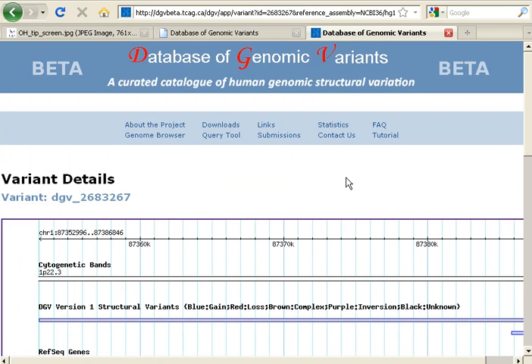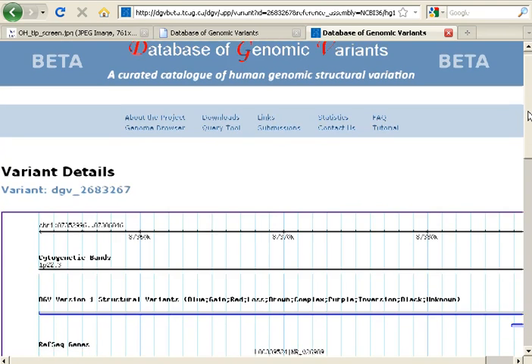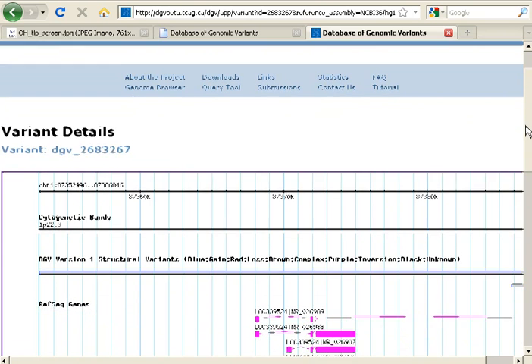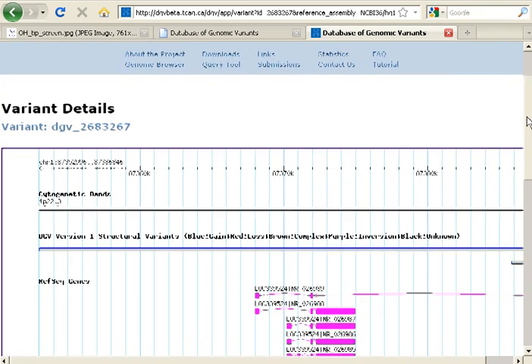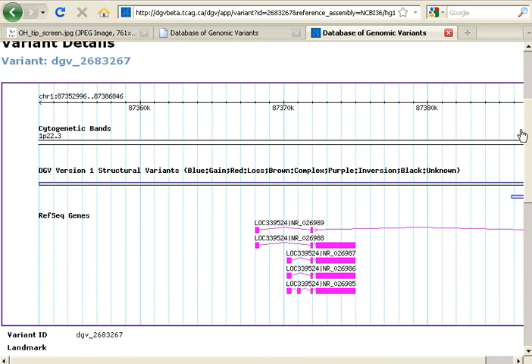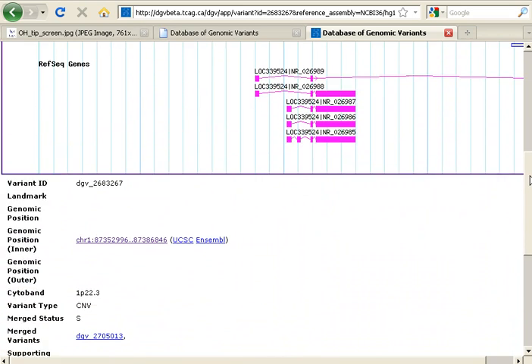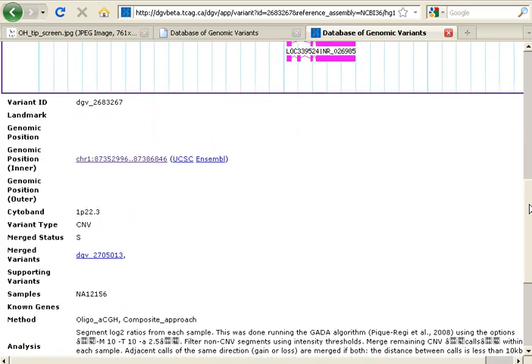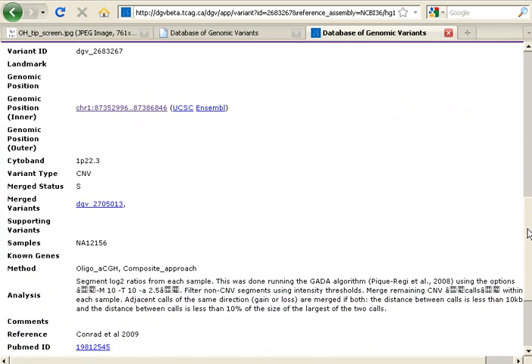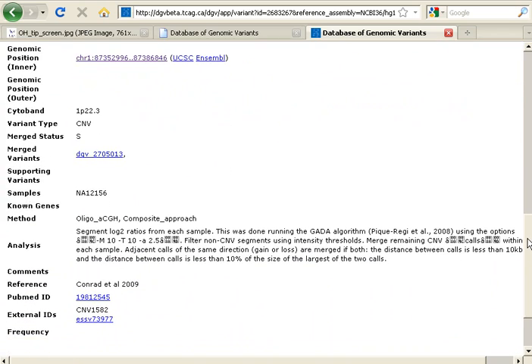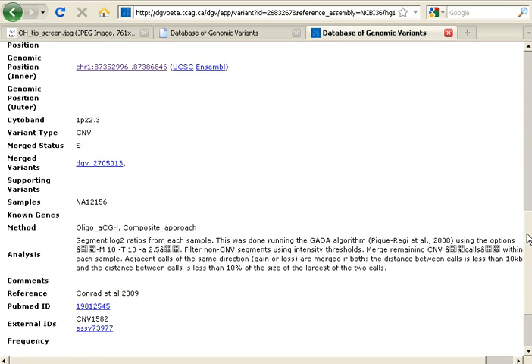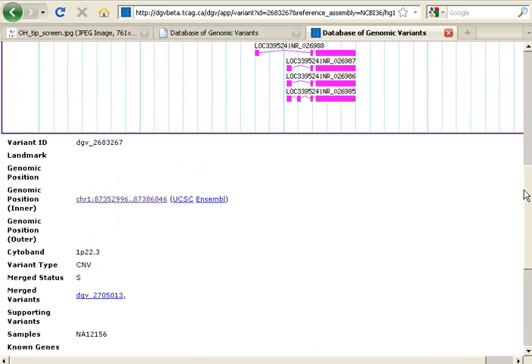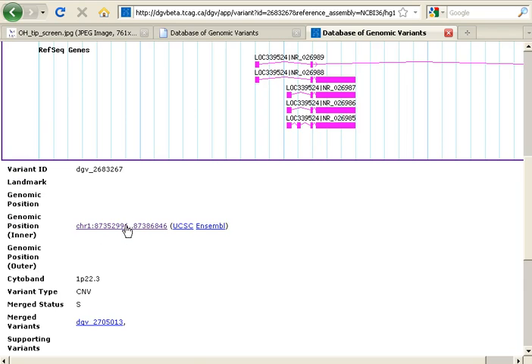I'm going to click that and scroll through it. Here is the Variant Details report. We see at the top a genome browser display. Scrolling further down, you see a variety of different information and links available for this variant. I'm going to click the Genomic Position link.